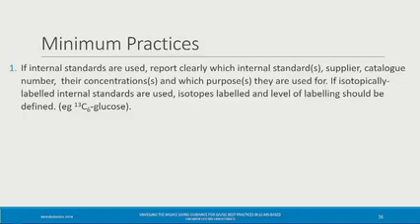Good, I think I see one hand up here, and then we'll move on to the next topic. Thank you. So I want to see if, in terms of lipidomics, if we have a class-based internal standard, would it be appropriate to use it to quantify, or semi-quantify, I would say, the same class species? So this is a widespread practice in lipidomics, and if you come to my talk tomorrow, I'll show you some results, how much the choice of internal standard impacts the quantification that you do. So I think the answer is it's complicated, right?